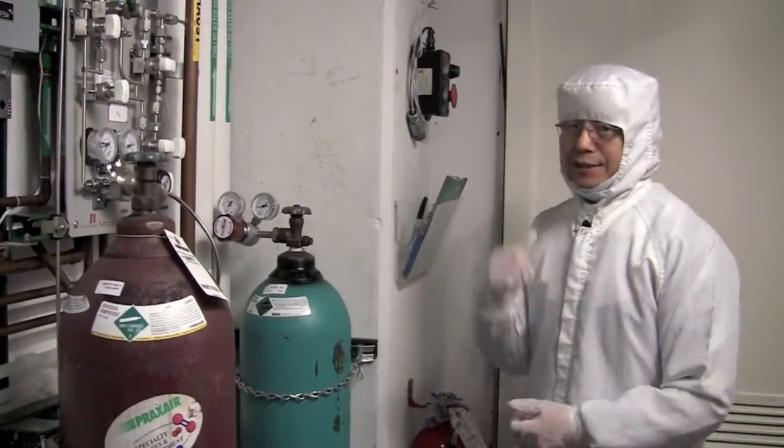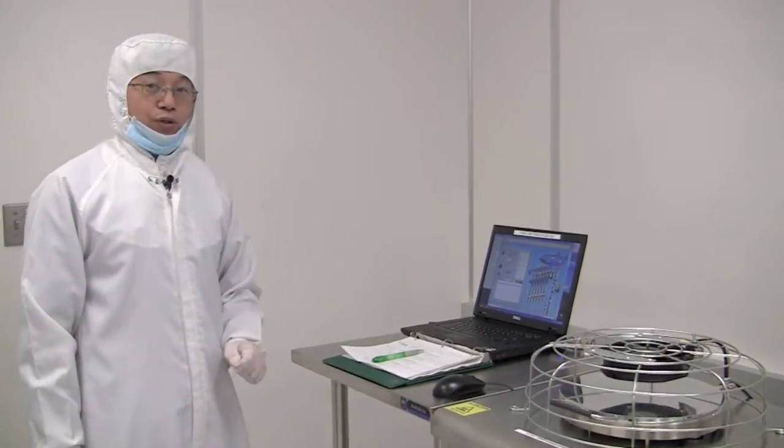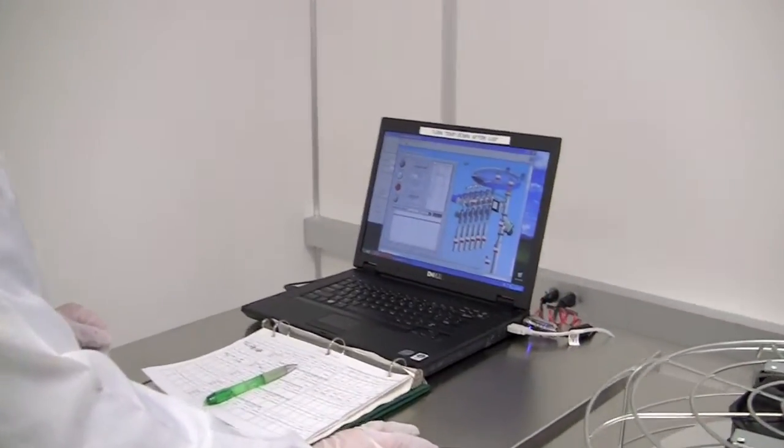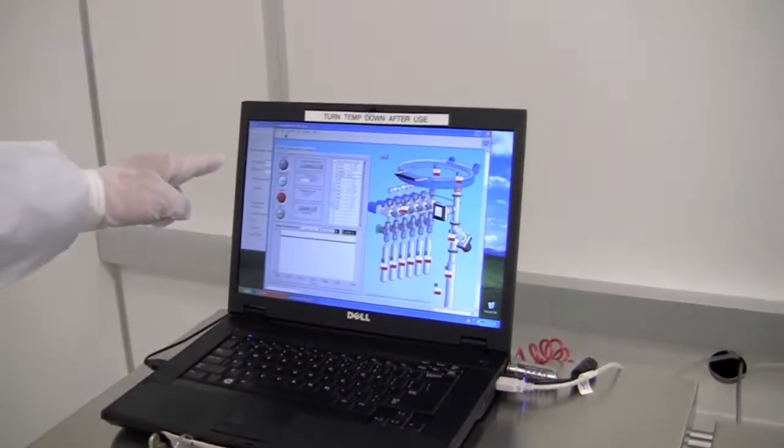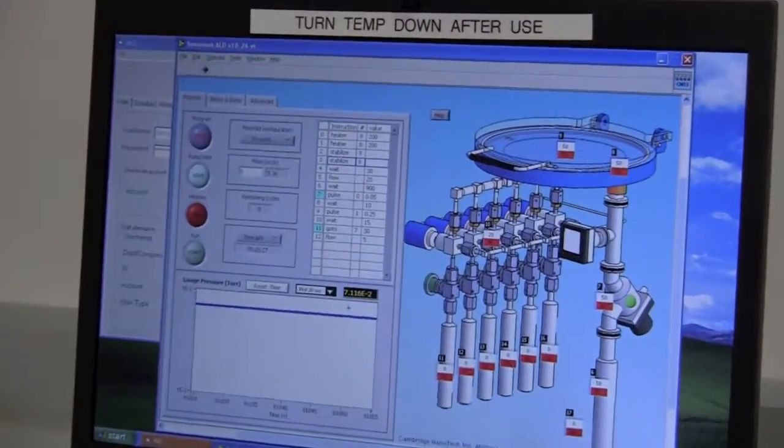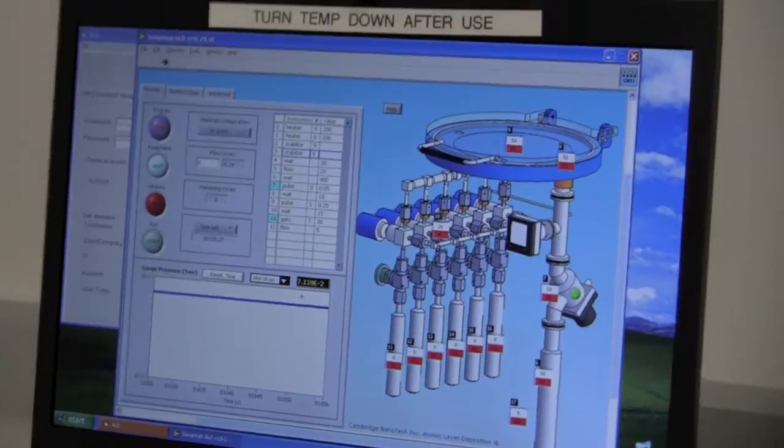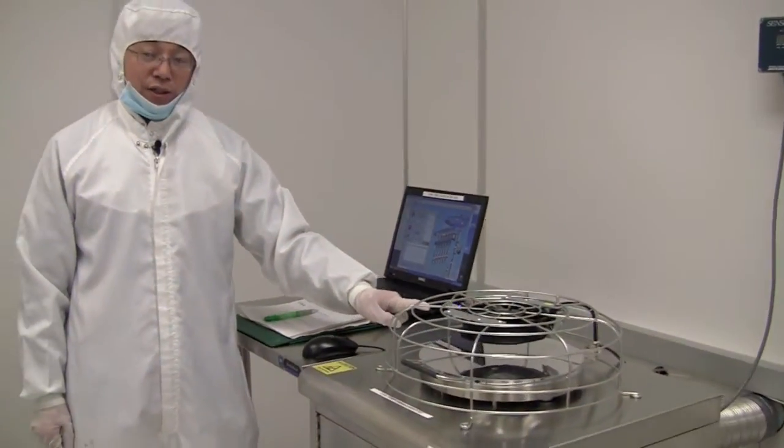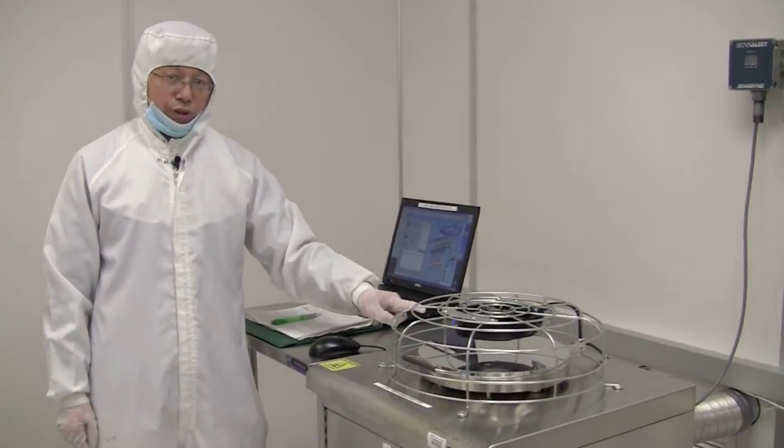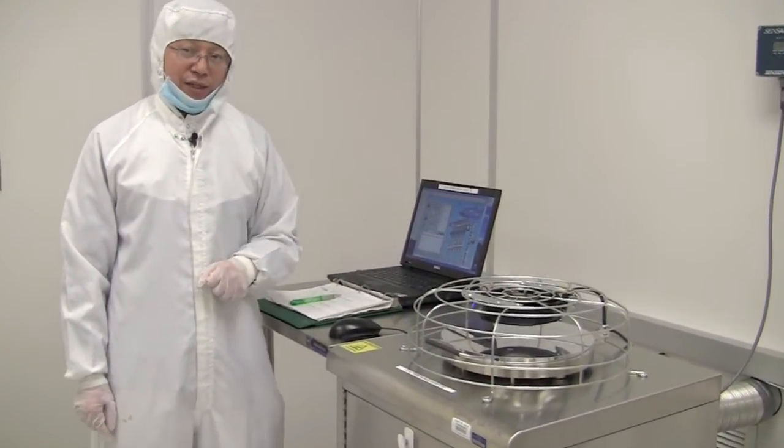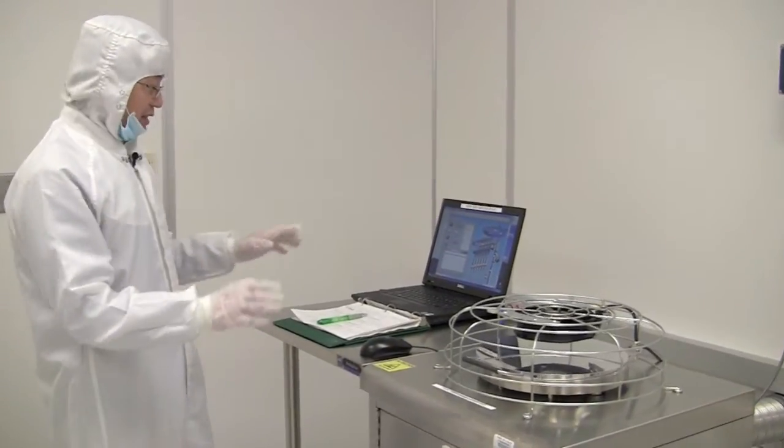Now let's go back. This is the software to run the tool. You'll notice the nitrogen flows at 5 sccm. The chamber pressure is around 70 millitorr. This metal shield is a heat guard to prevent users from directly touching the hot lid by accident. Everything looks fine.